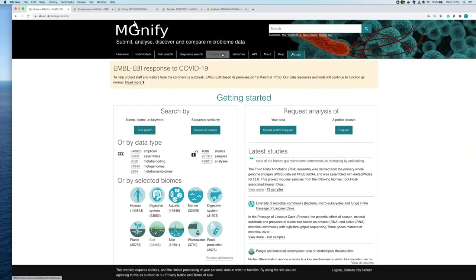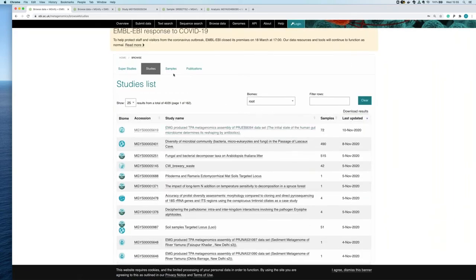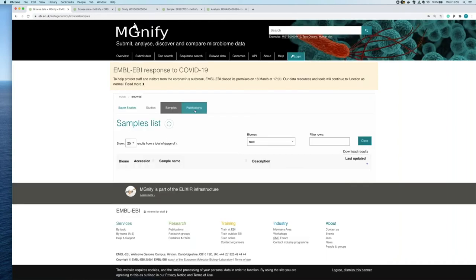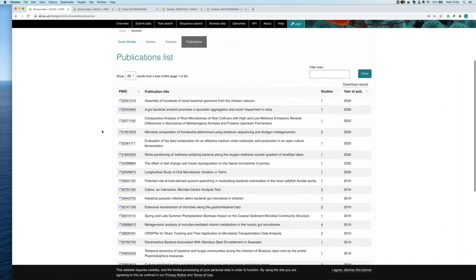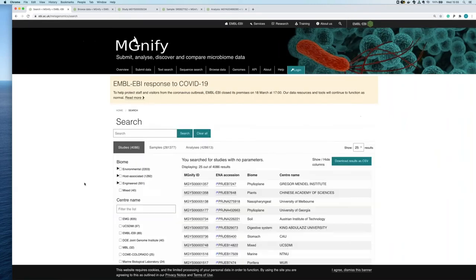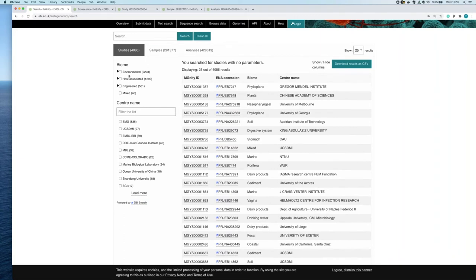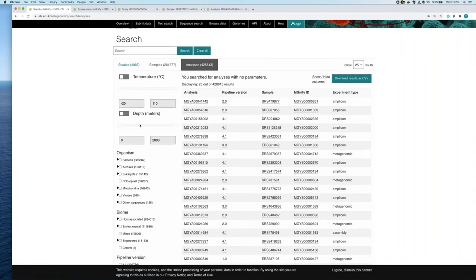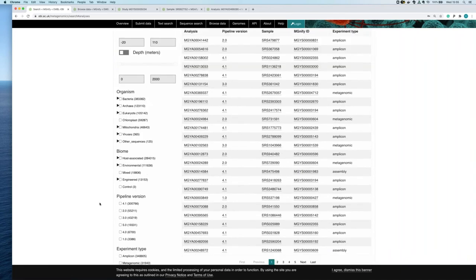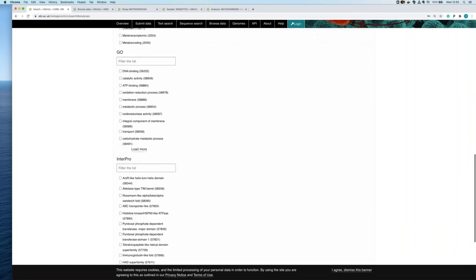You can also browse super studies — big projects — and filter studies by last updated date and biomes. In the text search, you can filter by study, samples, or analysis and apply a wide variety of filters such as temperature, depth, organism, biome, pipeline version, experiment type, and even some of the functional annotations.